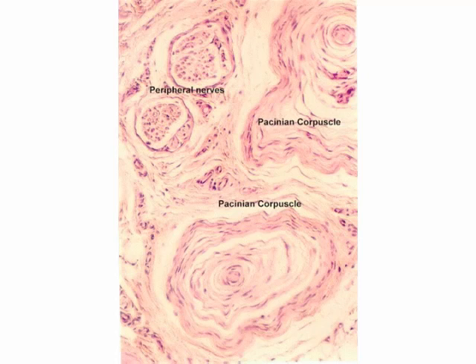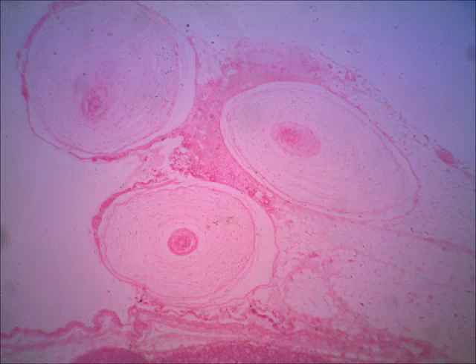Here you can see two, and the way to recognize these, it just looks like circles with other circles around them. A lot of times we describe these like a sliced onion. They're real easy to recognize. On this last slide in this little section, here you can see three Pacinian corpuscles, and they really do look like sliced onions, don't they?